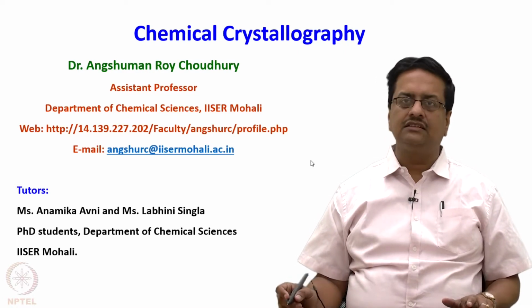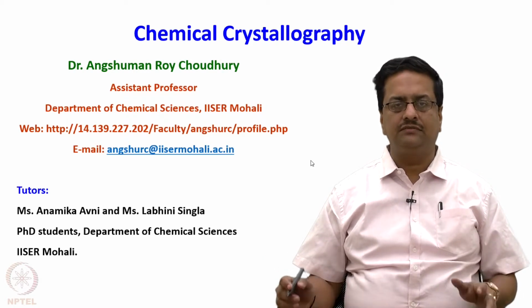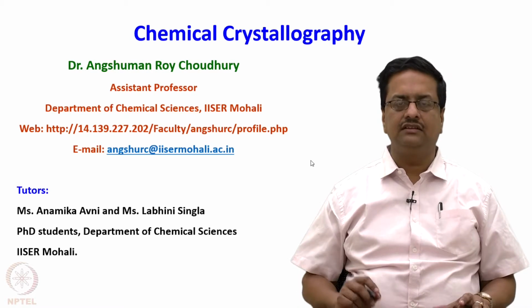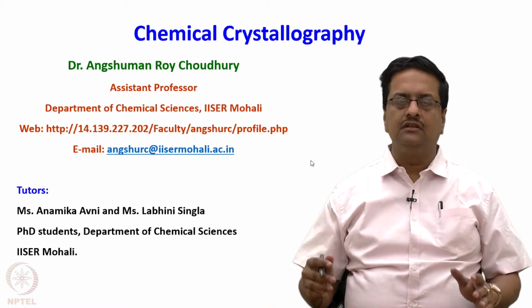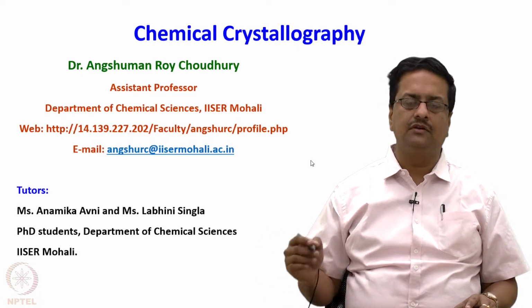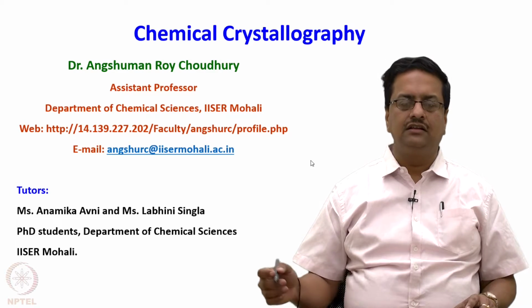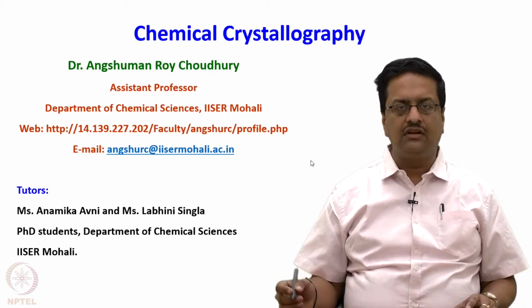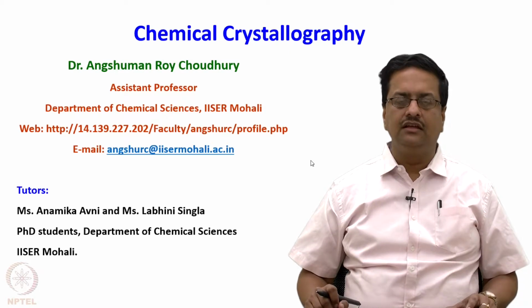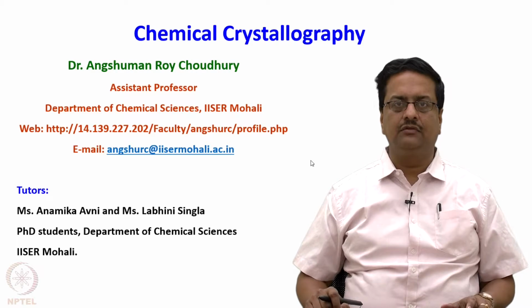In the previous lecture we were talking about the crystallization methods, different ways one can crystallize different types of materials. In that we discussed crystal growth from a pure solvent, crystal growth from a mixture of solvents, and the vapor diffusion method. Then we talked about crystallization of inorganic materials, and then we discussed in situ crystallization using an optical heating and crystallization device.